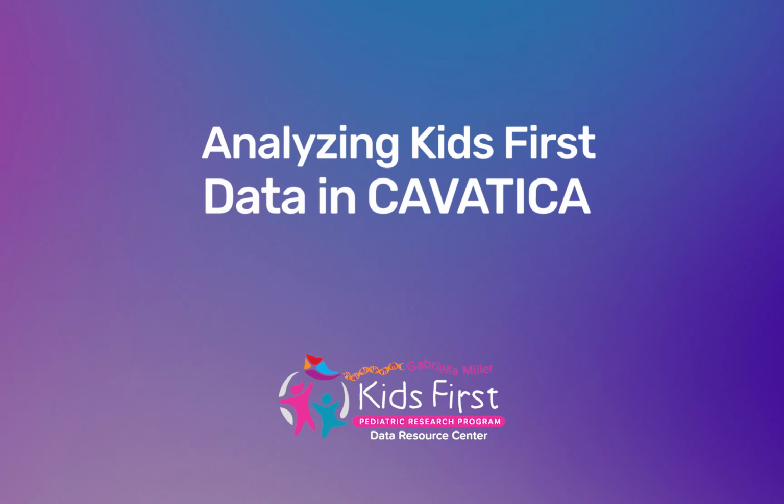Accessing registered genomic files through Kids First requires dbGaP access. If you'd like more information about how to log in and authenticate your dbGaP access, check out the second video in our user support video series by clicking the link in the video description.